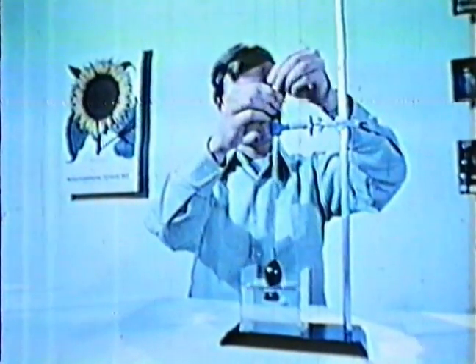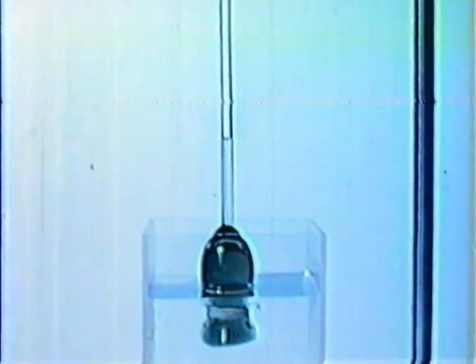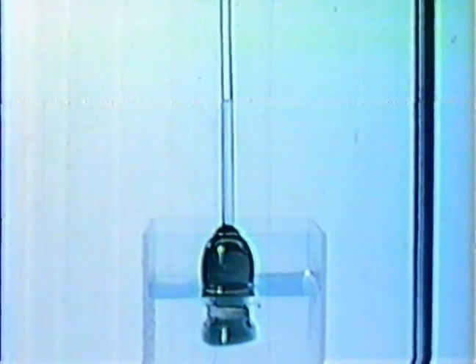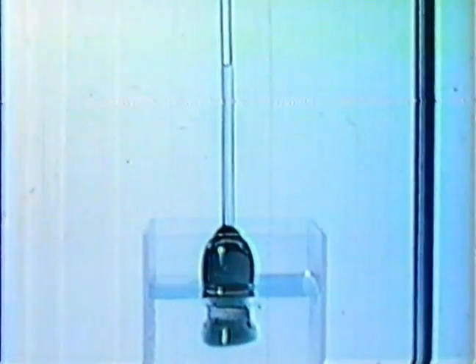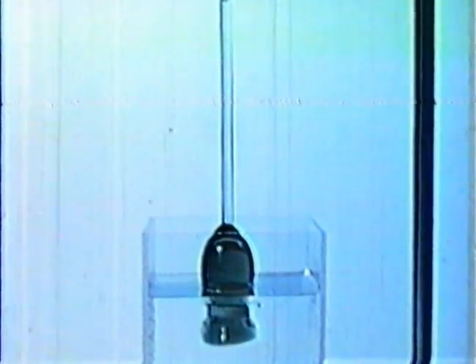We can see what happens in osmosis in an experiment that imitates what happens in living cells. The thistle tube contains a dyed sugar solution. The dish, water. A selectively permeable membrane separates the water from the dyed sugar. Within a few minutes, the water level has risen in the tube, but none of the dyed sugar has entered the dish.